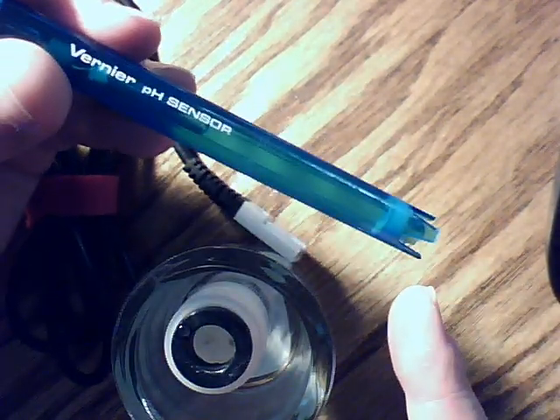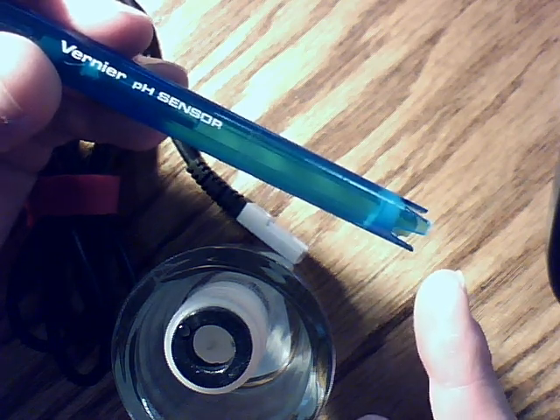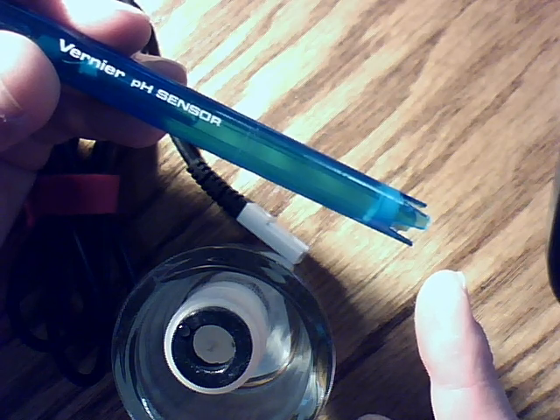If the pH meter tip ever becomes dry, it doesn't work anymore. So what we want to do is make sure it stays damp. If you're not using it, put it back in the container.